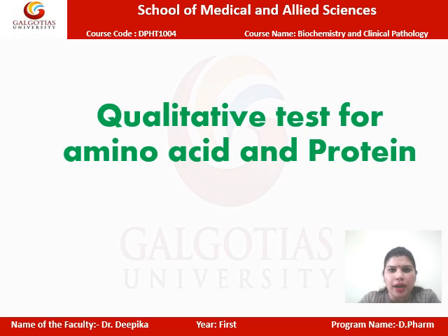Today we will learn about qualitative tests for amino acids and protein. Qualitative analysis is designed to identify the components of a substance or mixture.